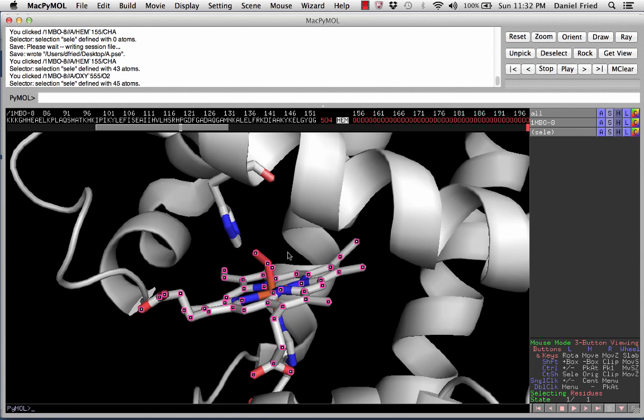One thing to notice is that you can click to highlight things in the molecule view screen or in the primary structure screen. So you can click up here on the heme to highlight and de-highlight, or you can click right on the structure itself. By the way, aiming your mouse is very important. If you're a little off, like if you're on the black part here, it won't really work. So you have to really click on the exact spot that you're trying to highlight.